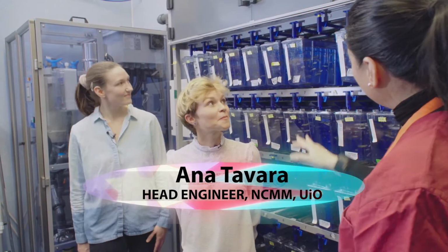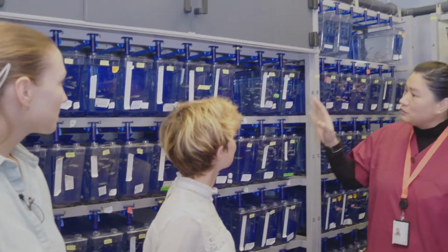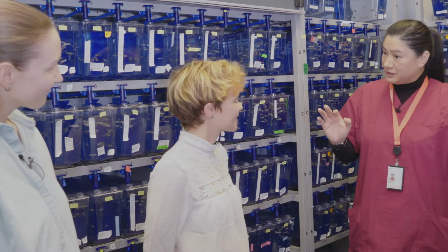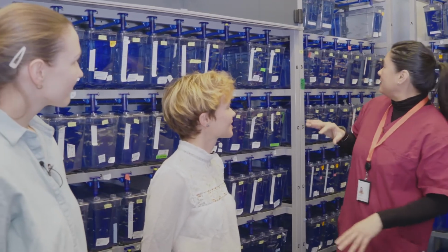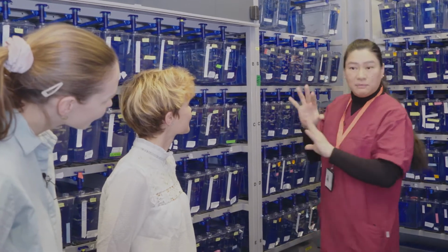Here in rack number 1, we are hosting the fish. We have them to produce embryos, the embryos that are being used by the different researchers in different projects. Here is another rack hosting mostly the immune lines.